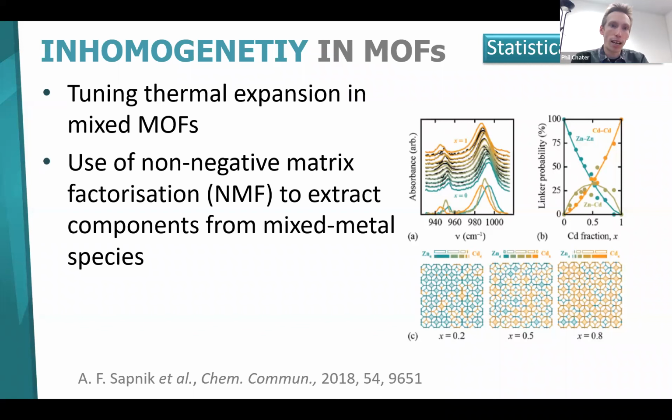So this is where they're looking for a zero thermal expansion material in a MOF. They were tuning between a completely zinc and a completely cadmium MOF, and they used NMF to explore the parts of the system that looked like the pure zinc MOF, the parts of the system that looked like pure cadmium MOF, and then isolate the bit of the data that's from this zinc cadmium part.